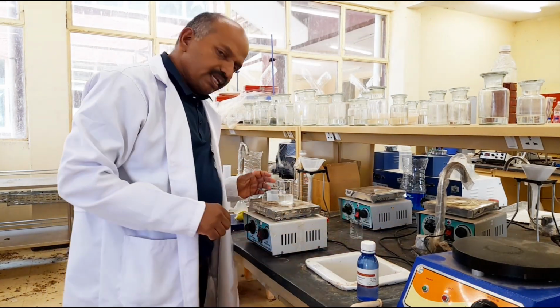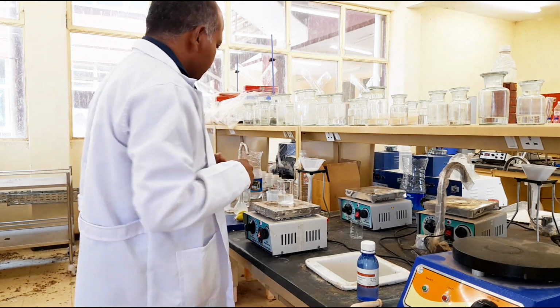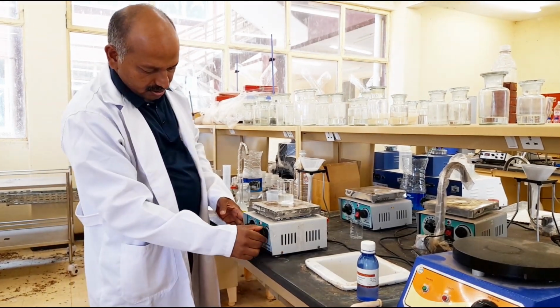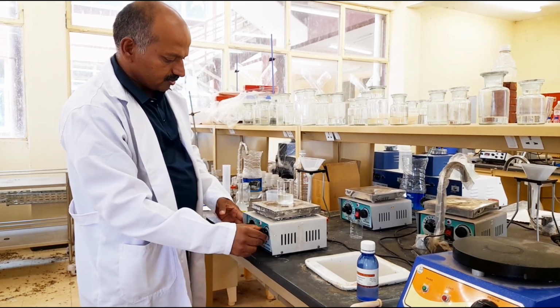Phenolphthalein doesn't produce any color in the acidic medium. That is why it is colorless. Now let us perform the titration experiment so that we can see the color change. Now I am switching on the magnetic stirrer instrument, and we will do the titration with sodium hydroxide.